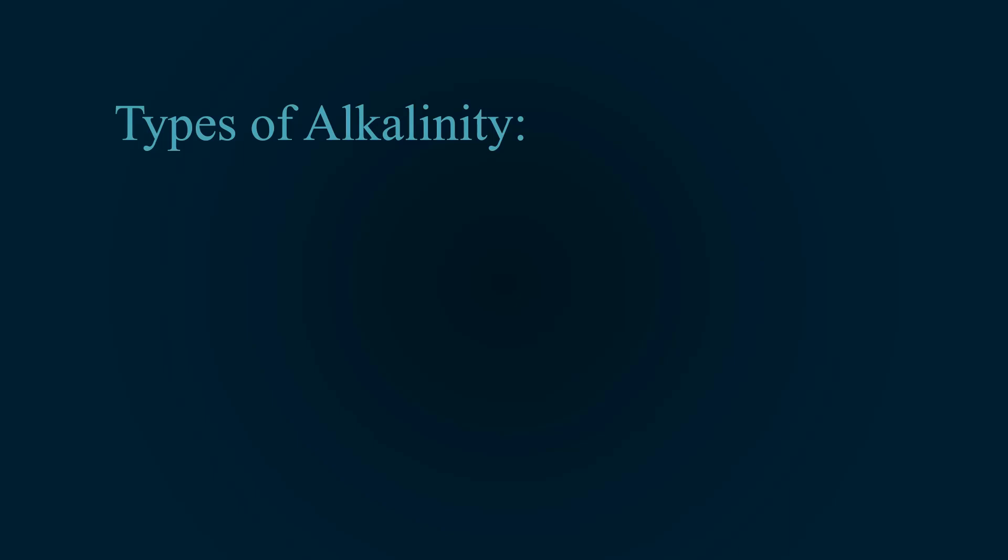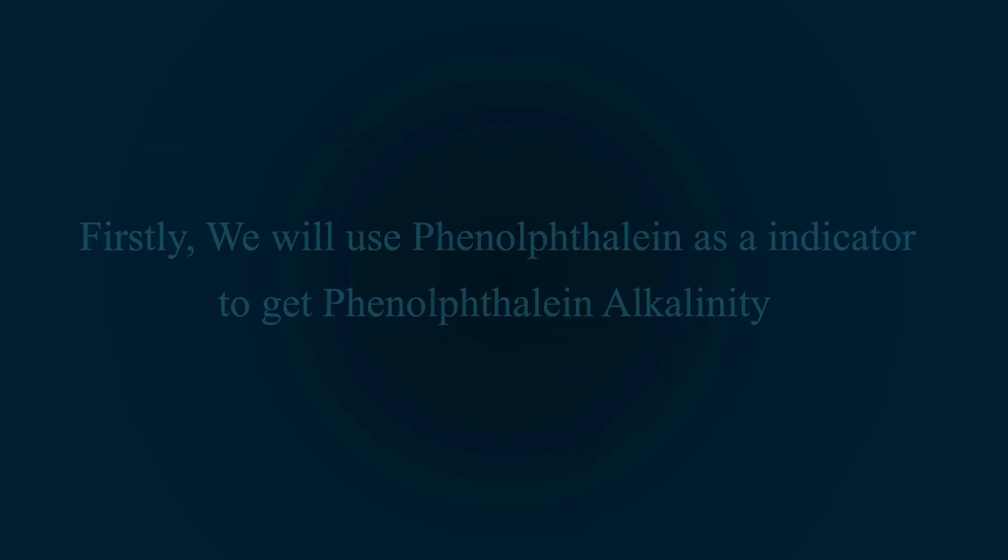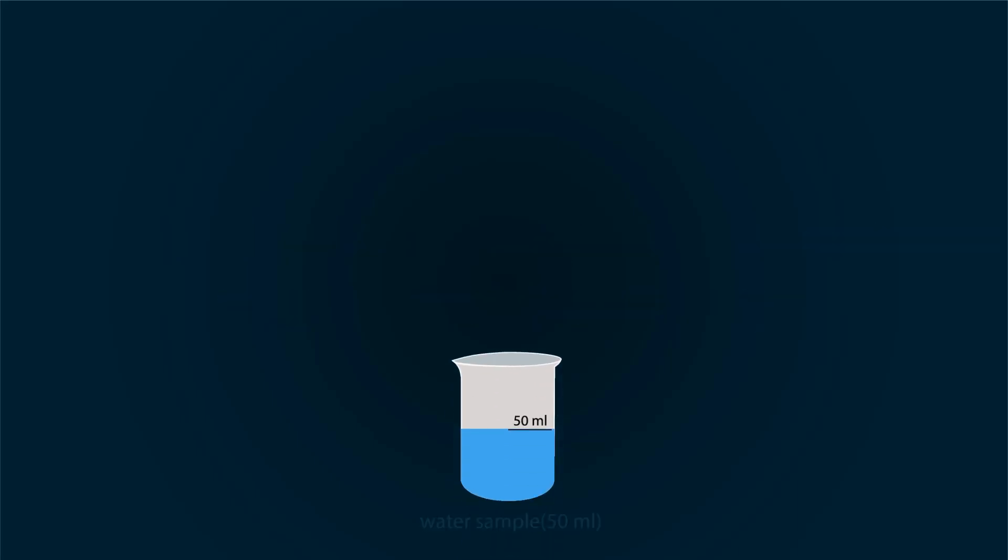There are two types of alkalinity: phenolphthalein alkalinity and methyl orange alkalinity. First, we will find phenolphthalein alkalinity by using phenolphthalein as an indicator. Take 50 ml water sample and add 1% phenolphthalein indicator into it. 2 to 3 drops would be enough.